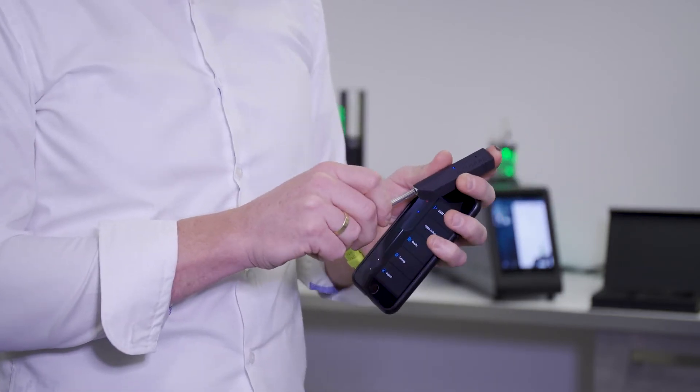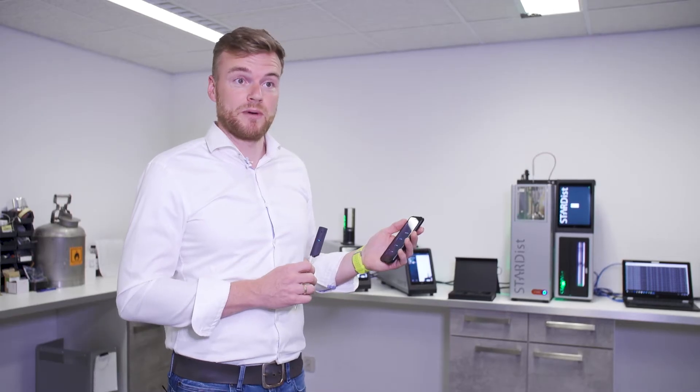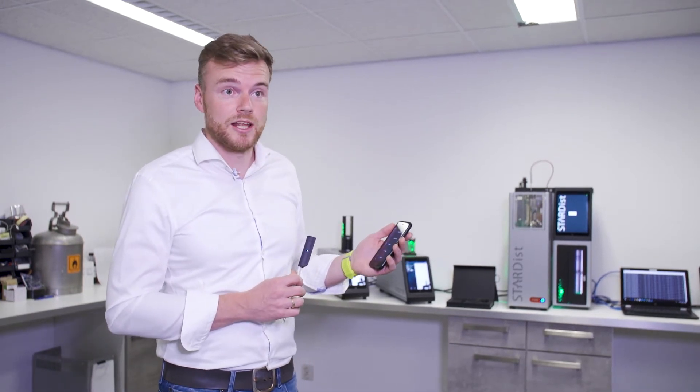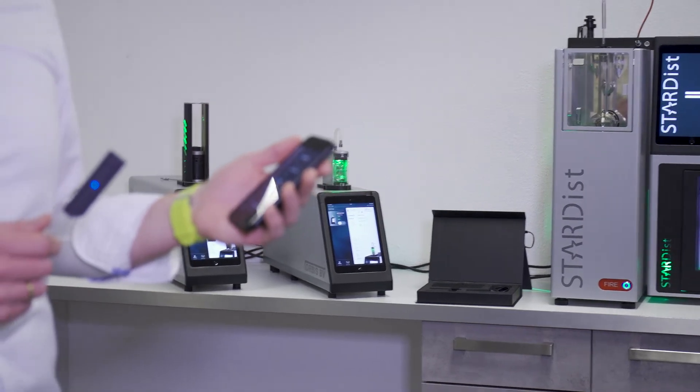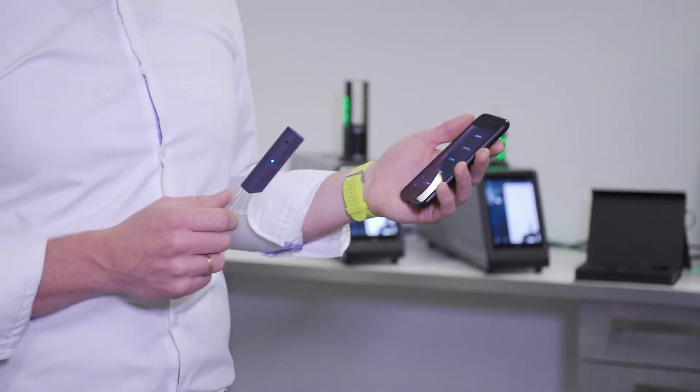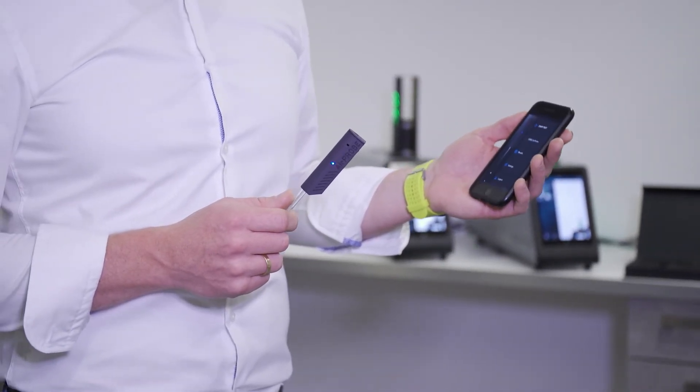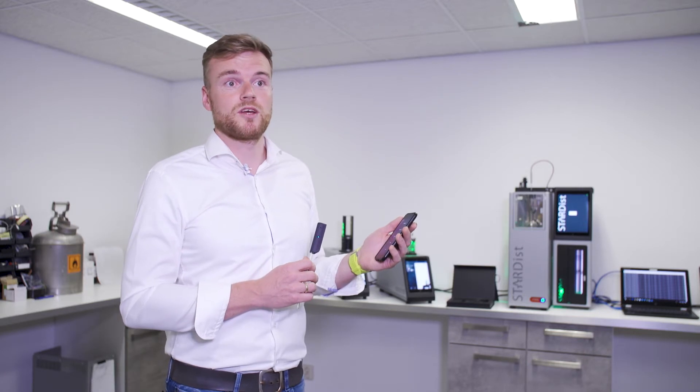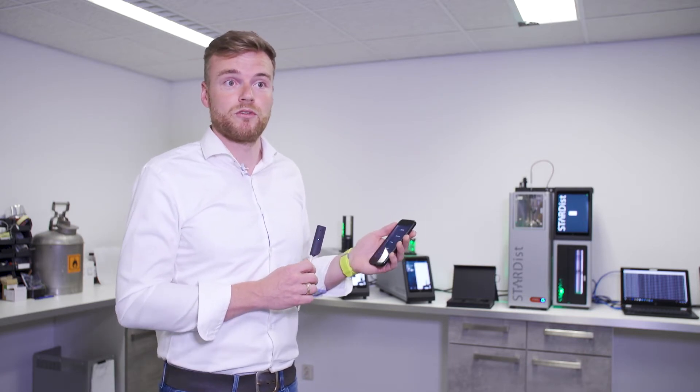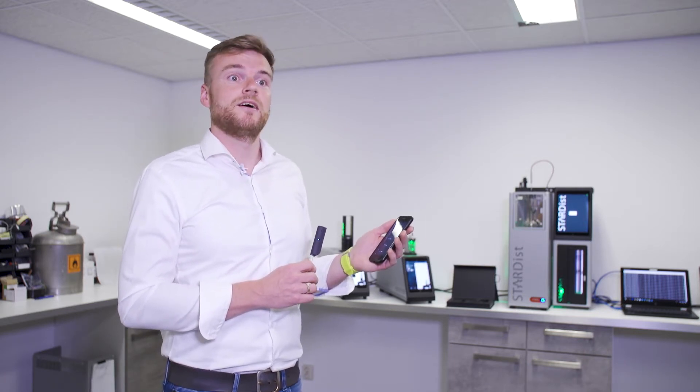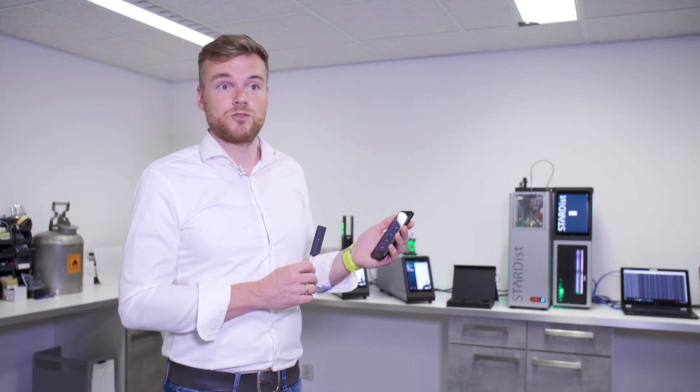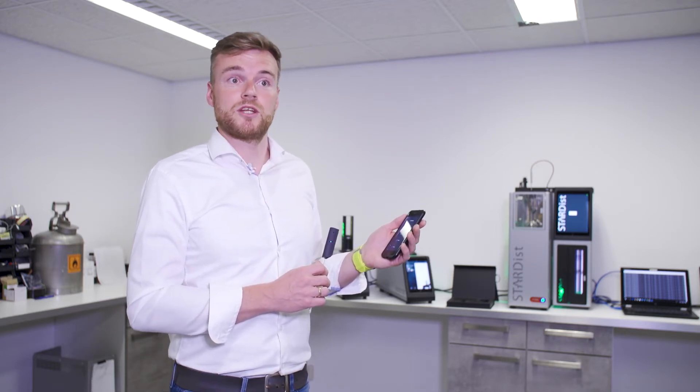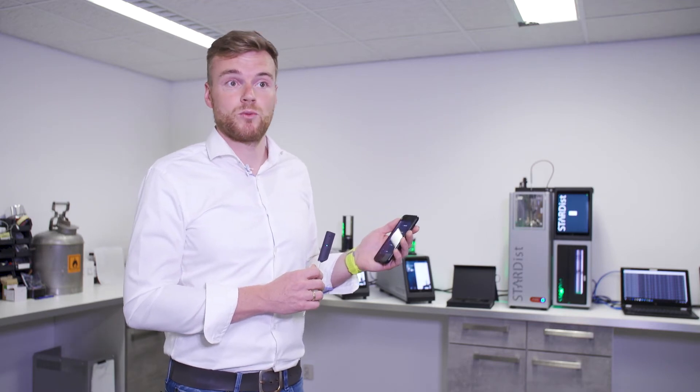This is AirProbe D86, a little instrument that replaces the mercury thermometer for a manual distillation test. It enables users to replace their mercury thermometer and increase the repeatability and safety of course, with no more shipping problems when shipping the toxic mercury thermometer worldwide. All in all it's a great little tool with everything inside to do the manual distillation test in a semi-automatic way.